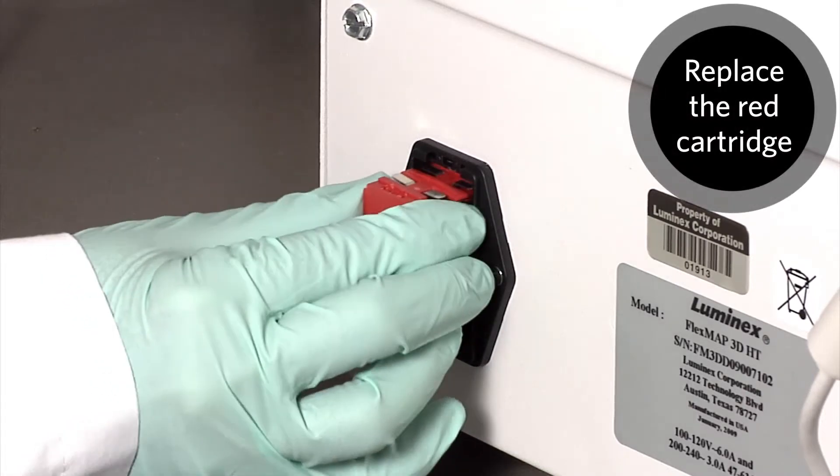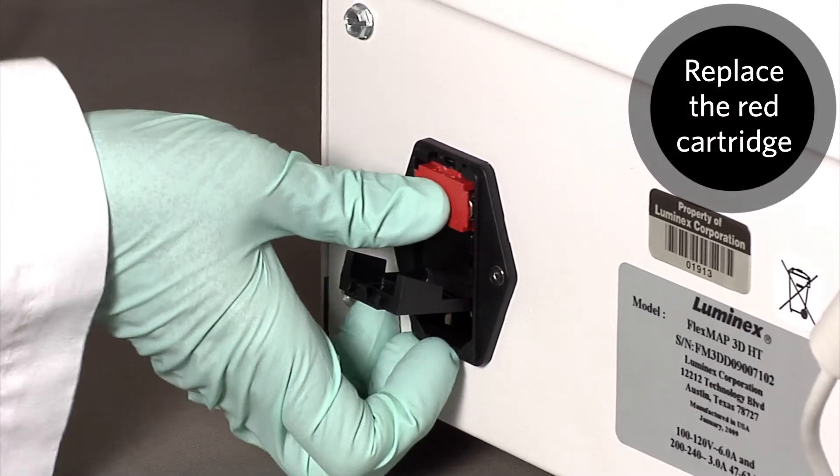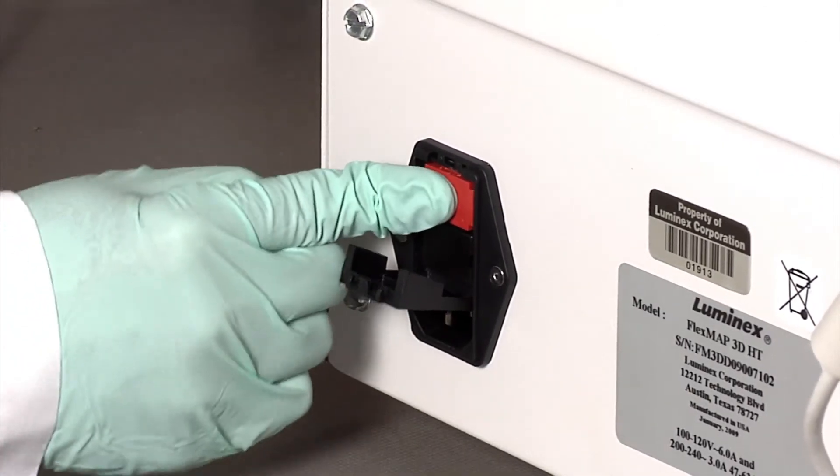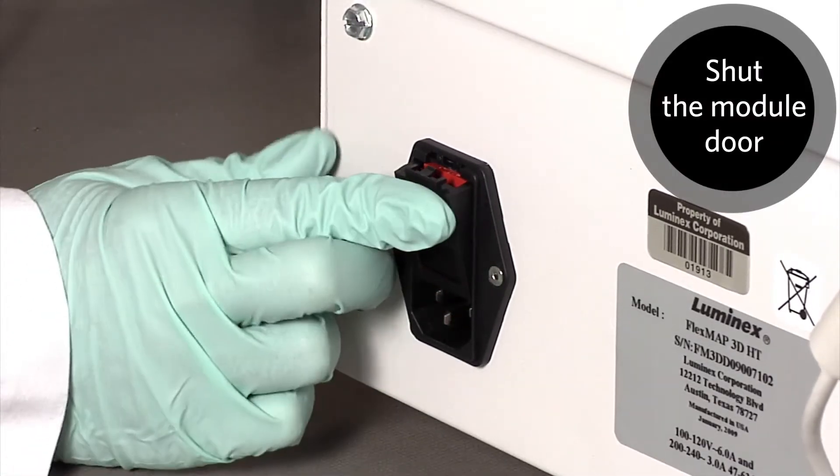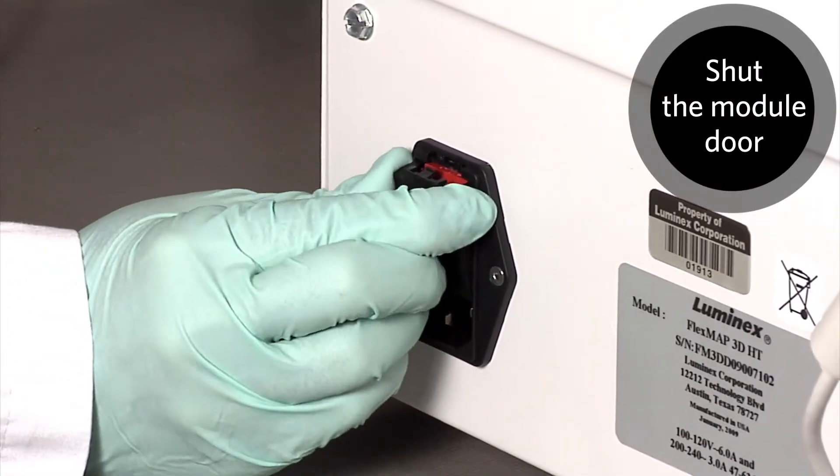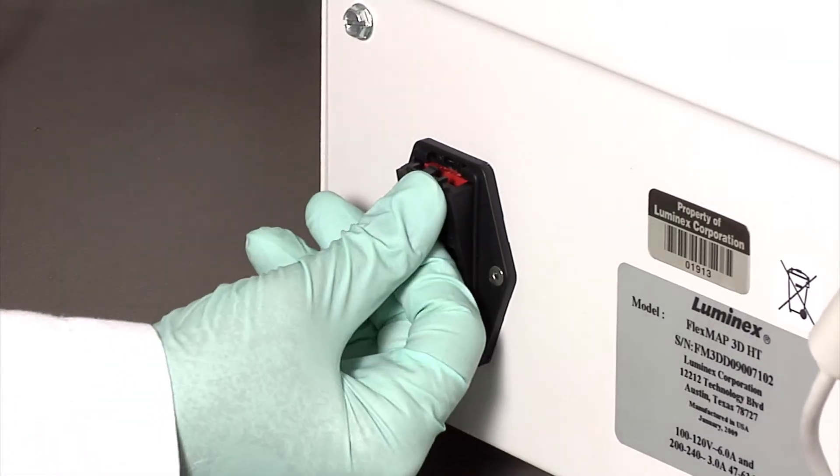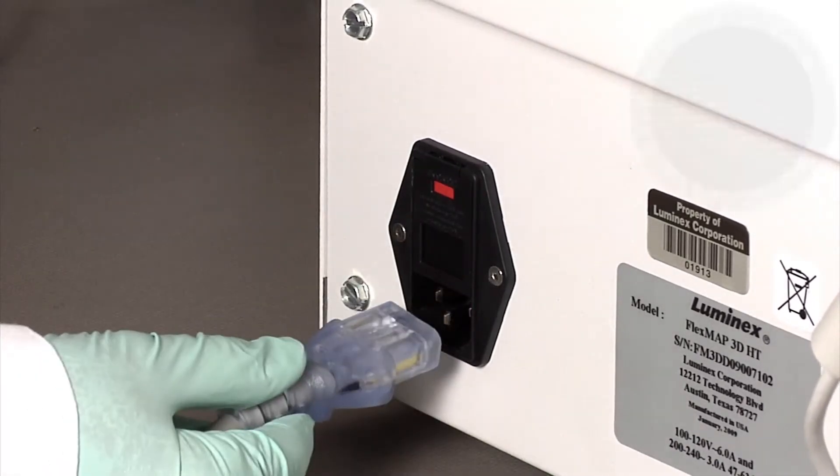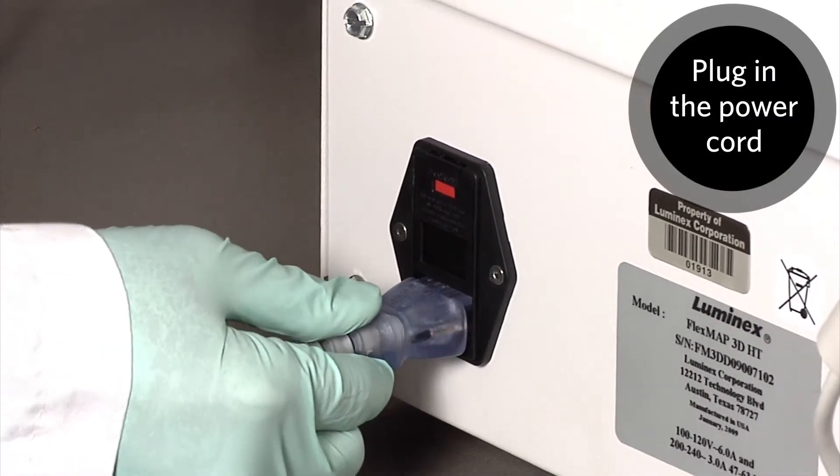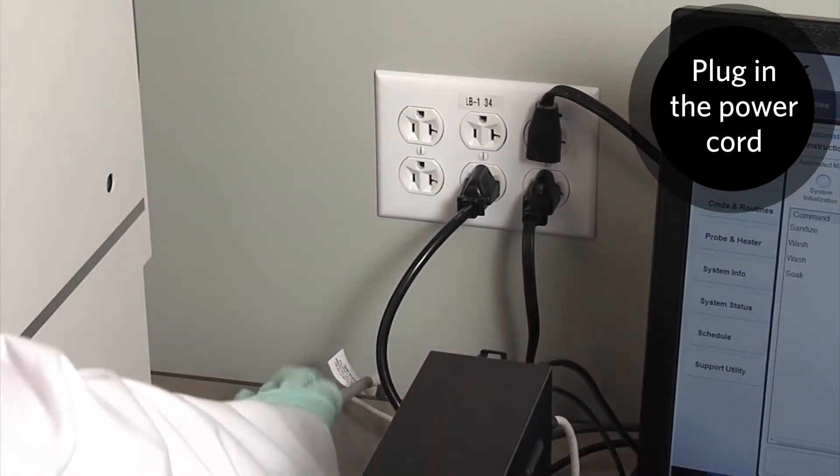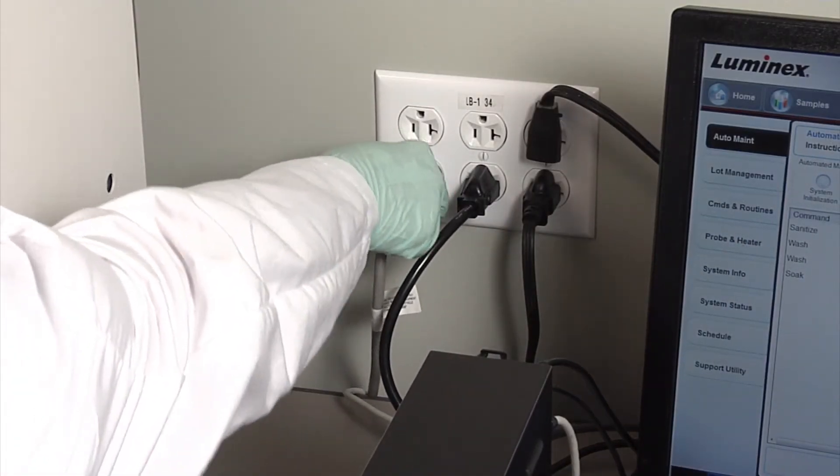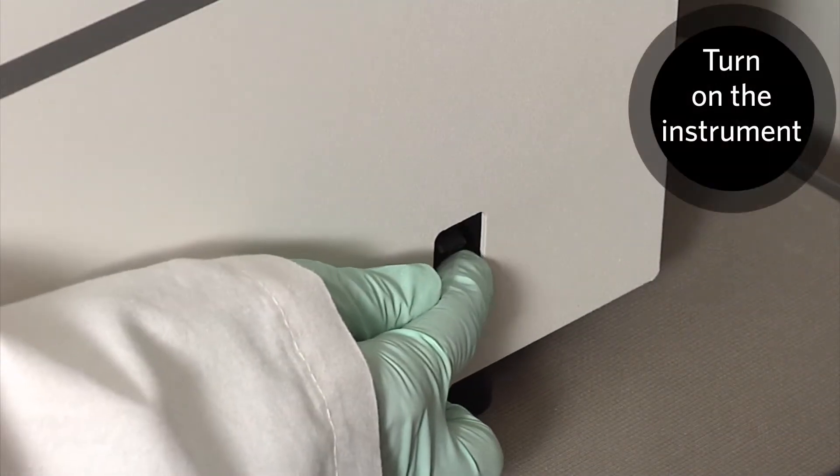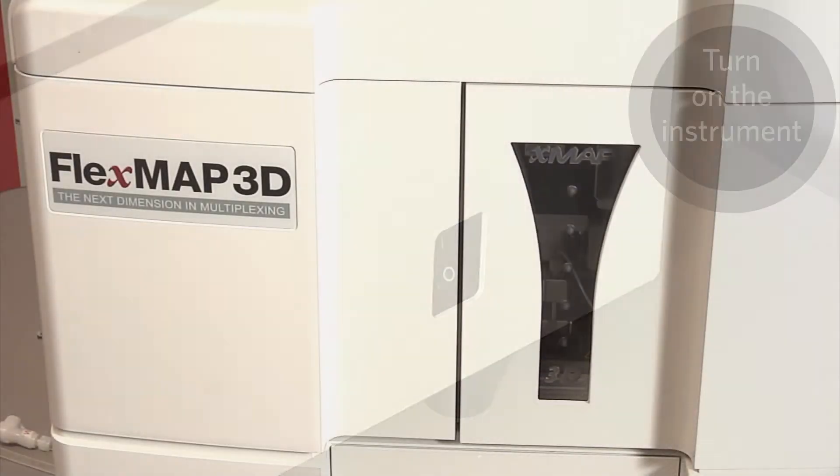Replace the red cartridge. Shut the module door. Plug in the power cord and turn on the FlexMap 3D instrument.